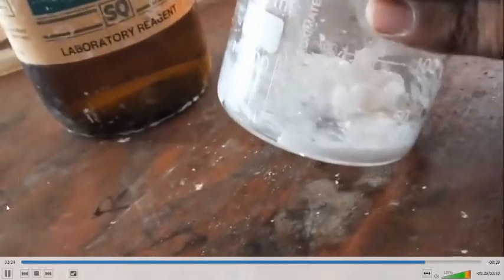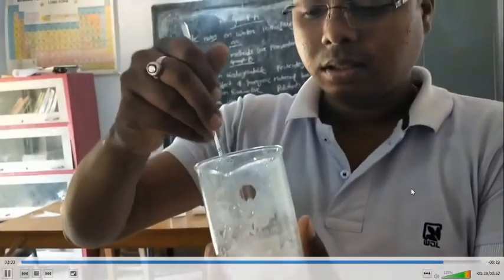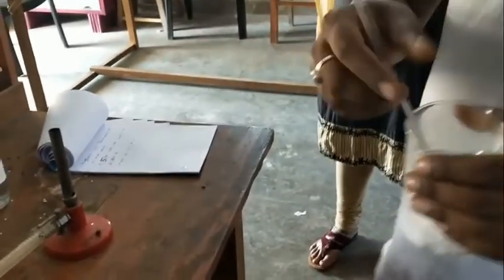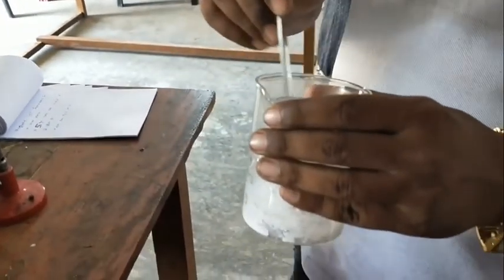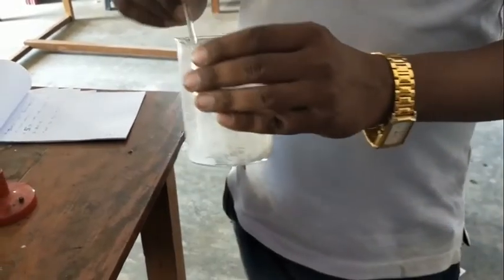Now we get a resin known as urea formaldehyde resin. Finally we get this resin, which is prepared by adding, first, formaldehyde, a measure of 10 ml, then 5 gram of urea. Then constant stirring. Last we add a little amount of sulfuric acid. Then finally we get urea formaldehyde resin.